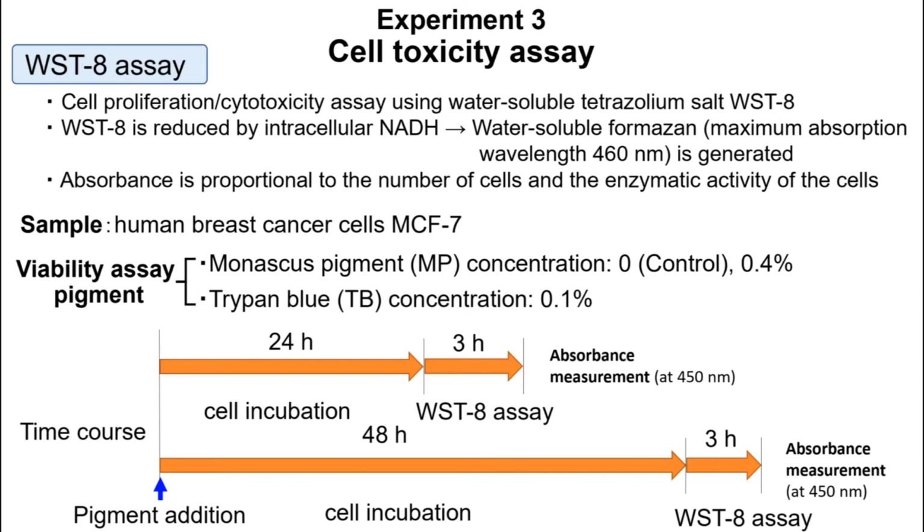When WST8 is reduced, WST8 produces water-soluble formazan with a maximum absorption around 460 nanometer.